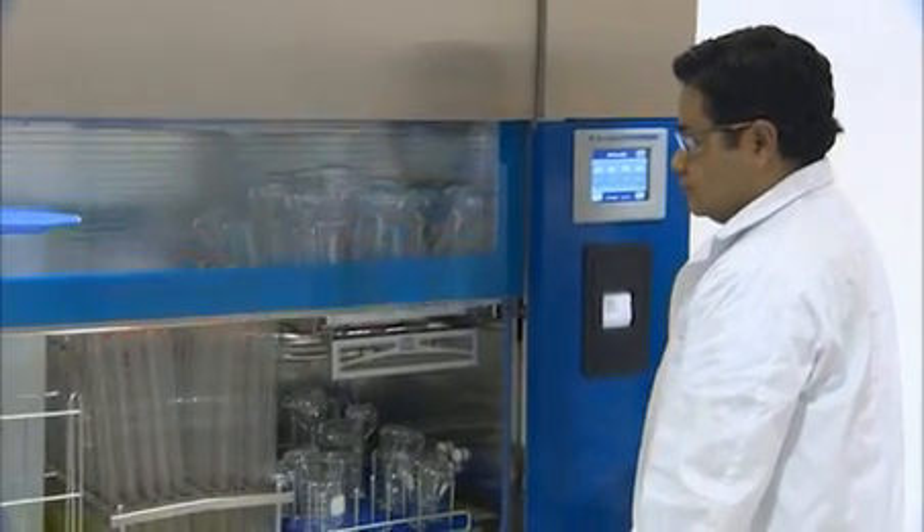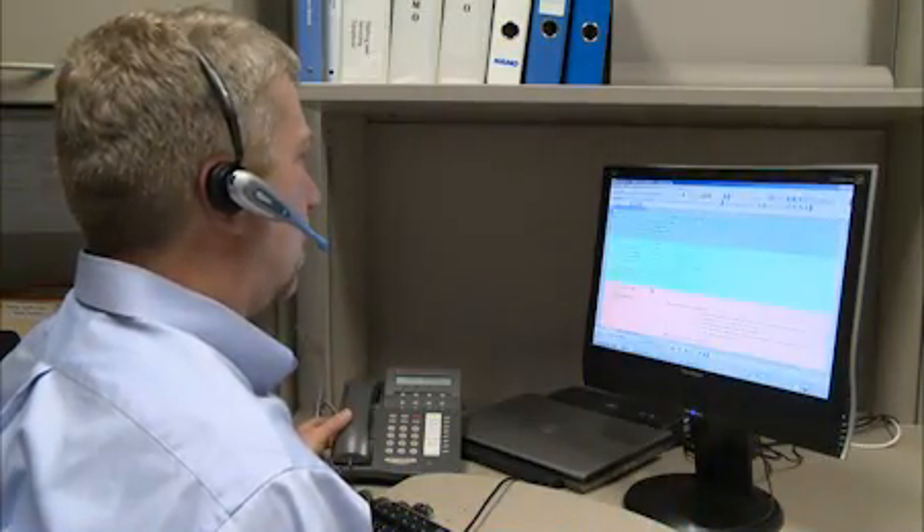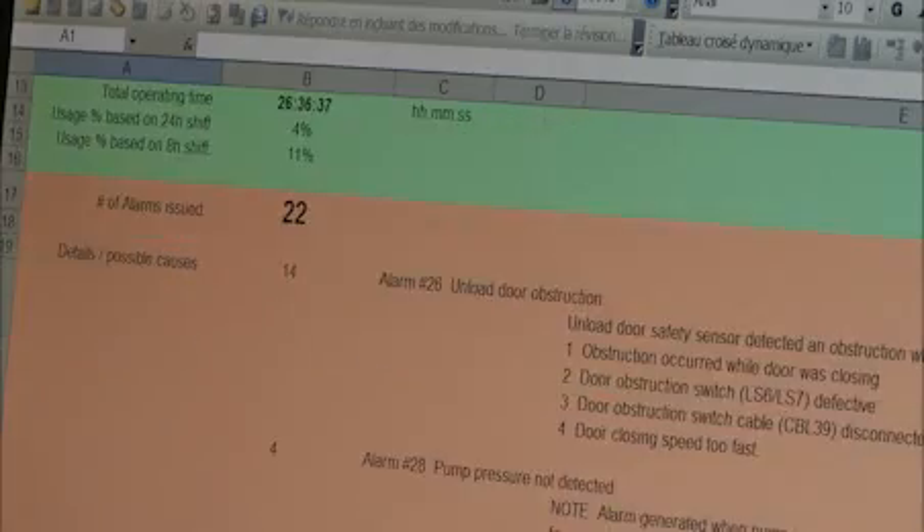The control system can also be connected to the Steris ProConnect response center. ProConnect provides 24/7 remote equipment monitoring, helping reduce downtime and lower maintenance costs.